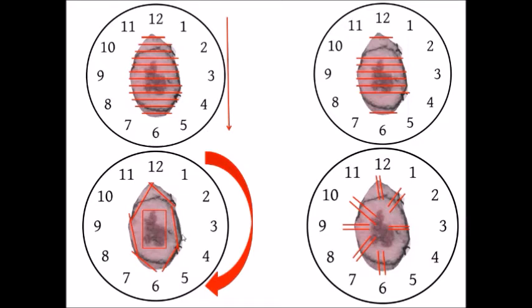Here's an example of en face, where we take en face sections of the peripheral skin soft tissue margins all the way around the skin ellipse, and we submit them in a sequential fashion, beginning at 12 o'clock clockwise, and then we block out the lesion and show its relationship to the deep margin. Here's another example of perpendicular sections per clock face, where we just take these perpendicular sections of the clock face 12, 1, 3, 6, 7, 9, and 10. Once again, this is just kind of dependent on your group and what practice you guys work for.